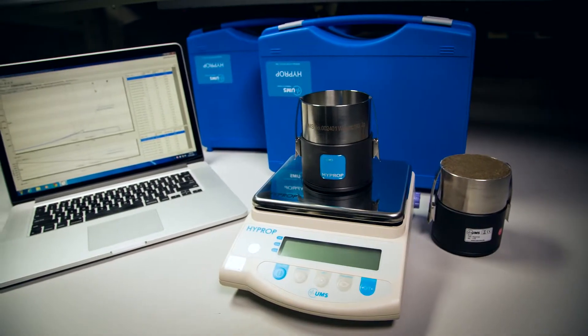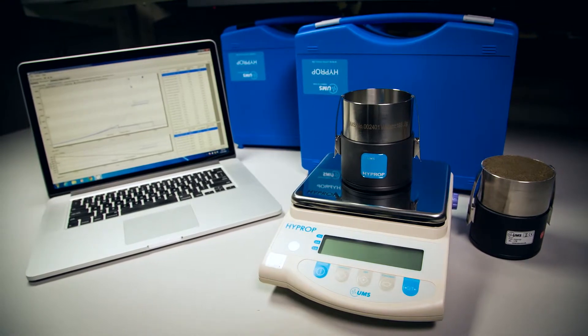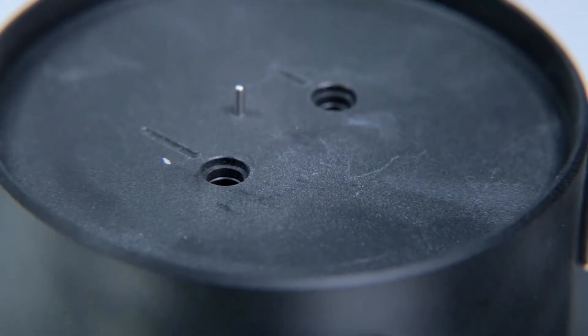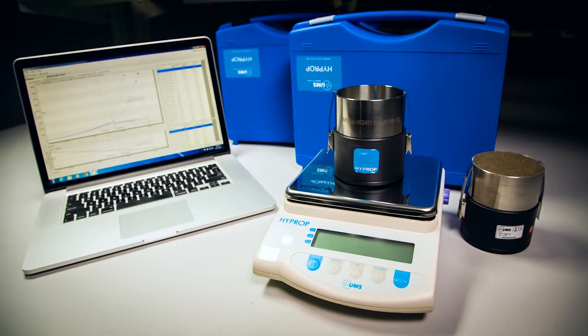The HI-PROP is a precision instrument designed to measure soil water potential or soil suction. This allows you to generate soil water characteristic curves and at the same time measure unsaturated soil hydraulic conductivity. In order to accurately make these measurements, the HI-PROP requires highly sensitive pressure transducers. Because of this, it is important to take care when using this instrument in order to ensure longevity. Today I'm going to go over some tips to help you properly care for your HI-PROP.